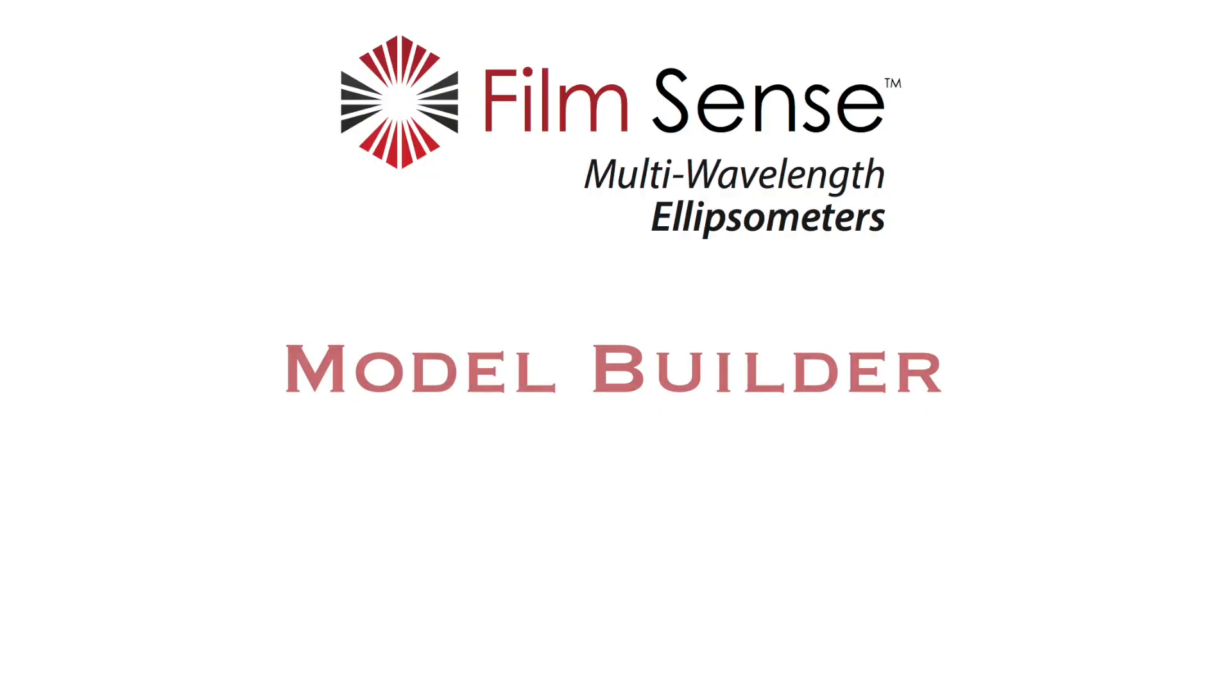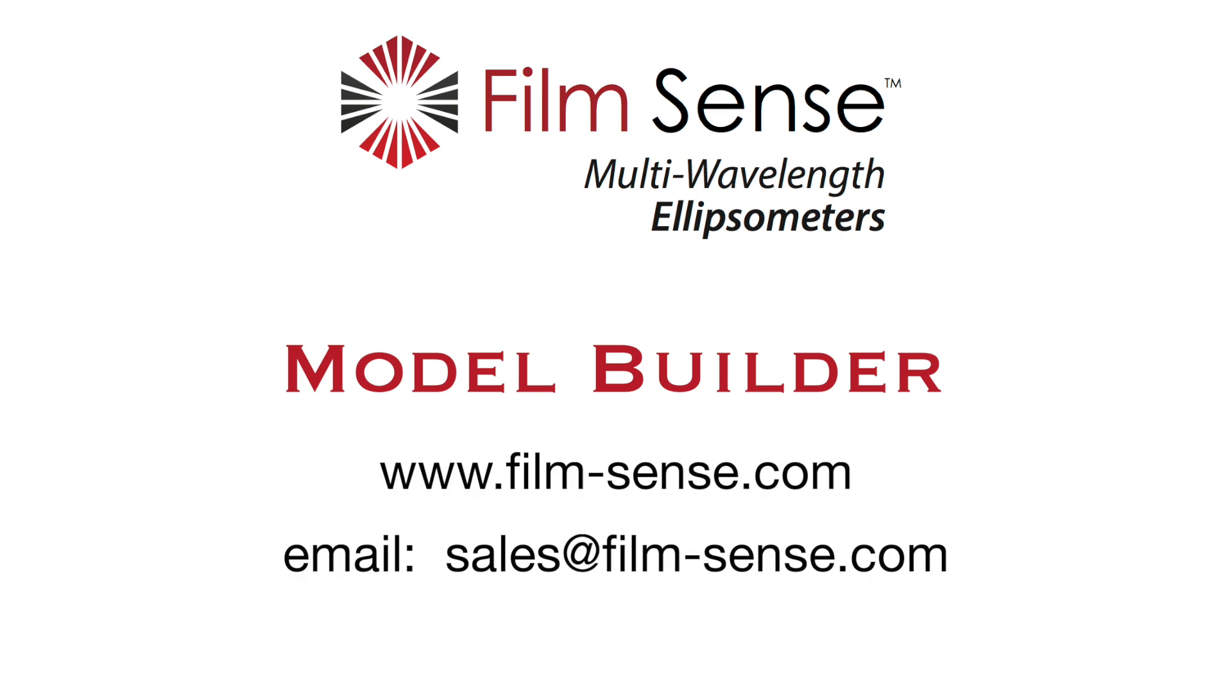As you have seen, Model Builder can automate the ellipsometric data analysis process for most common thin film samples, and FilmSense is continually evolving Model Builder to support even more types of thin film applications. For more information about our affordable multi-wavelength ellipsometers, please visit our website or contact us.